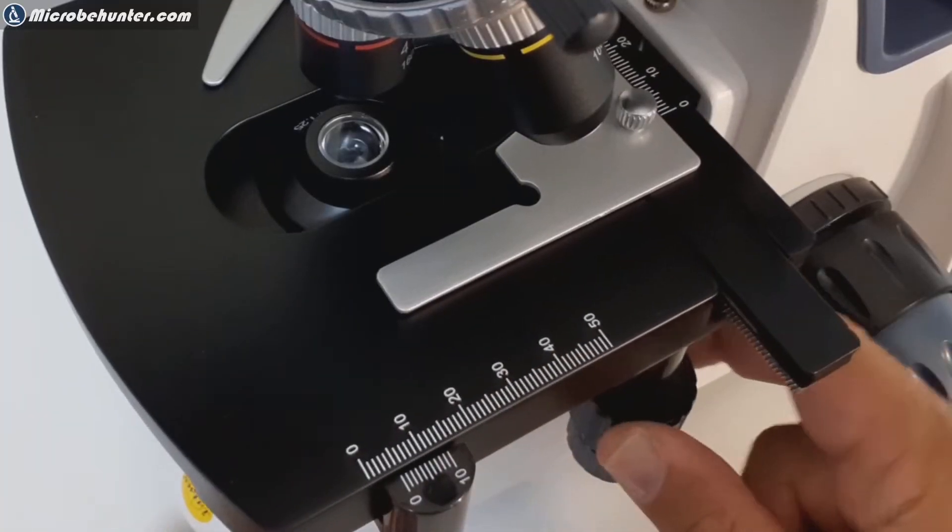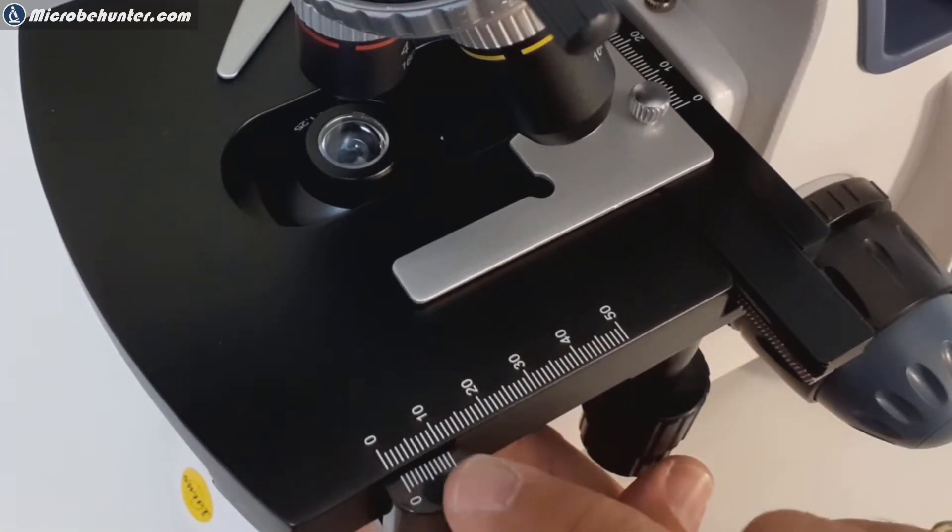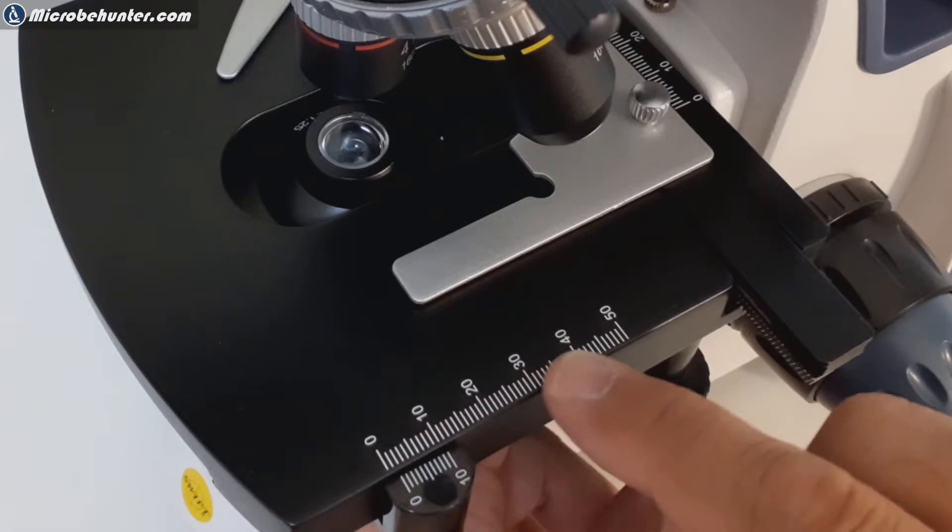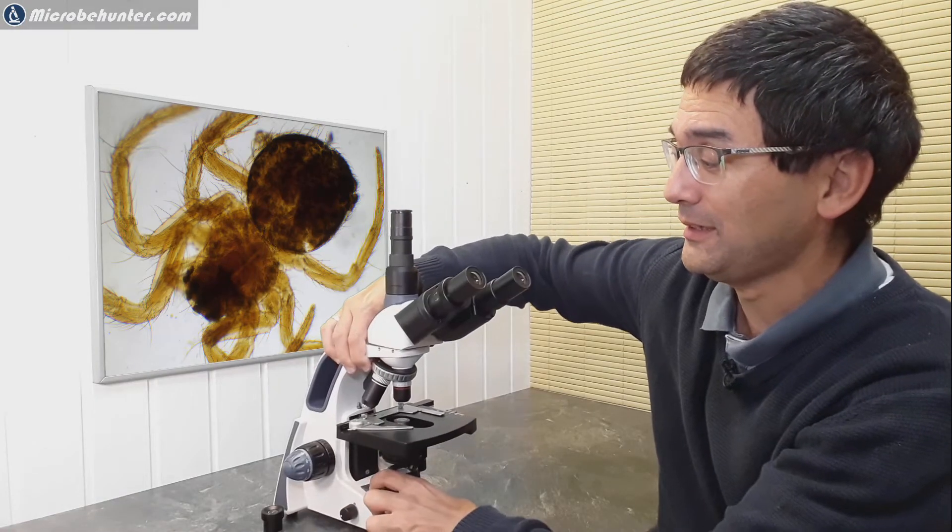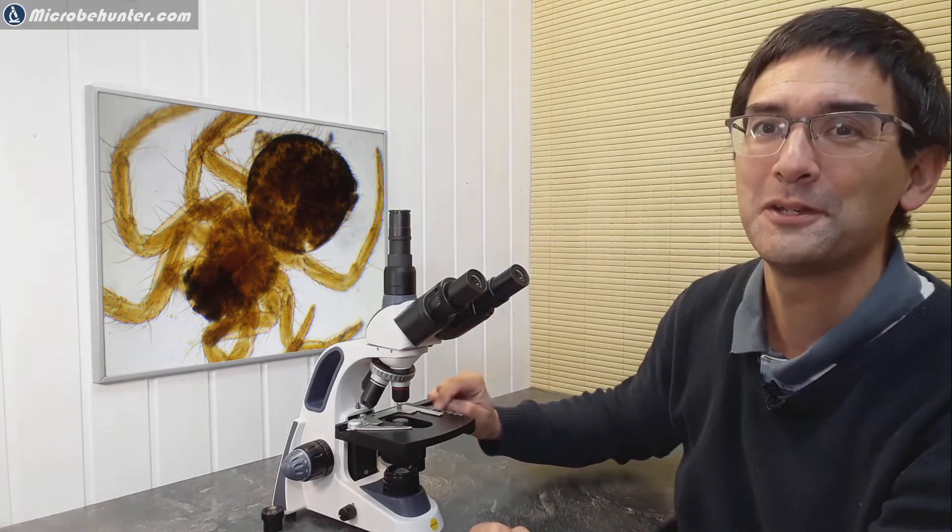In the mechanical stage micrometer here, they printed it the wrong way because normally when I use the microscope at least, I always use it like this so that the stage is accessible to me, but then the numbers here are upside down.